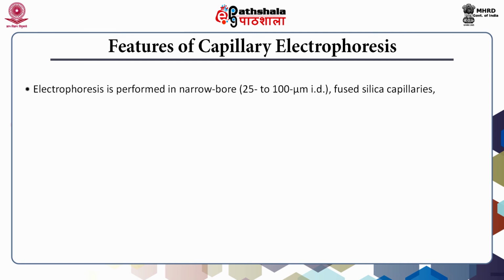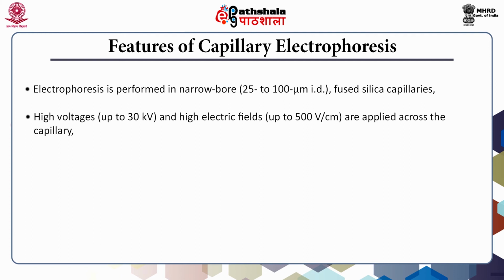Electrophoresis is performed in narrow bore fused silica capillaries of about 25 to 100 micrometer internal diameter. Electrophoresis is carried out at about 30 kilovolts. This creates a high electric field up to 500 volt per centimeter across the capillary.